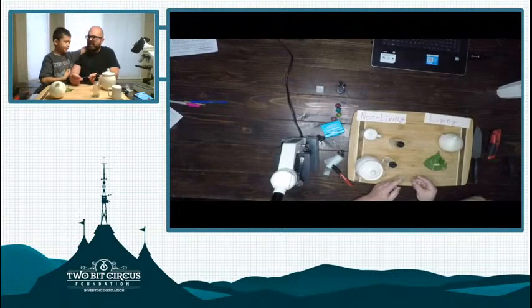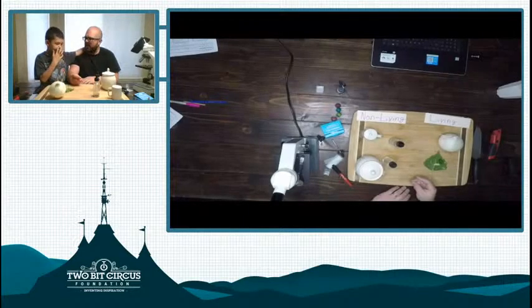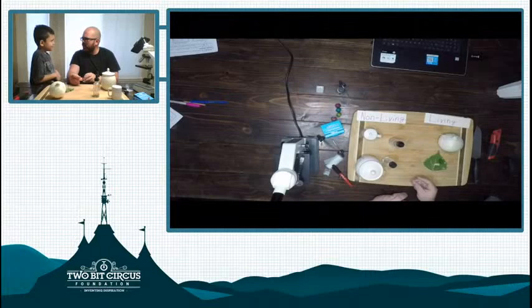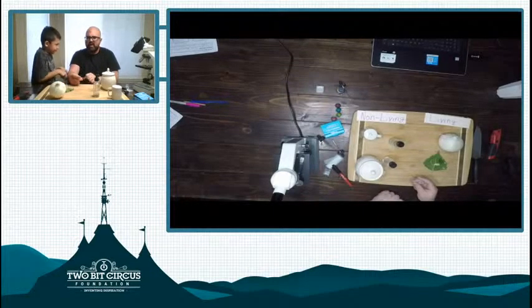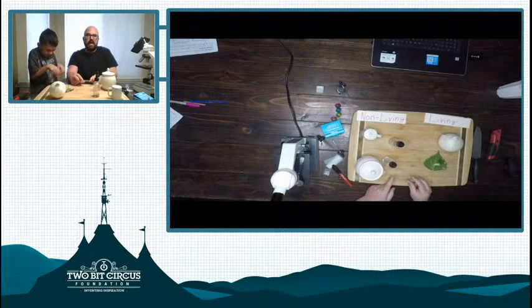And how do you know if something's going to be alive after we put it under the microscope? Because if it doesn't have cells, it's not alive. Oh, so you learned something about cells already, right? Did you learn that at school? Mm-hmm. Okay. Wow, you go to a good school. They taught you about cells already? Awesome. So we are going to be learning about see if things have cells by putting them under a microscope.